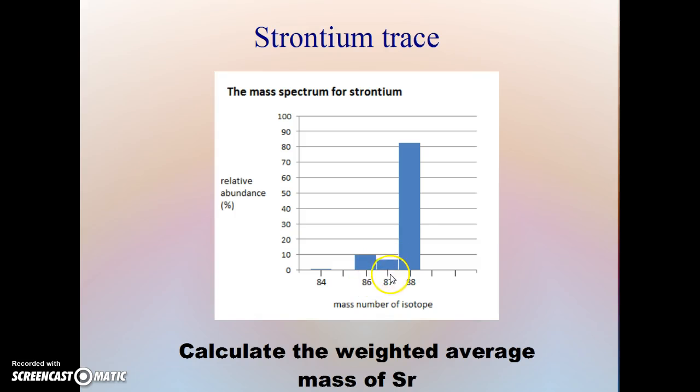Multiply those to get the four amounts and then add them up and see how that compares with the periodic table and its atomic mass for strontium. I think you'll find that you can get very, very close, even just estimating what these percent abundances might be. Most of the time when you get a trace from a mass spec, you're going to get the numbers.